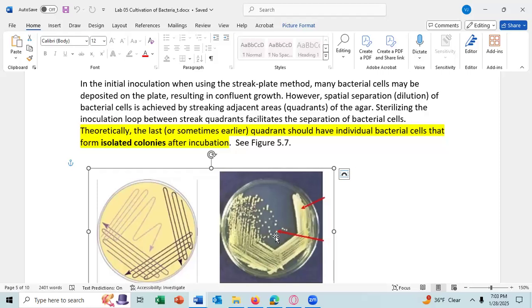And so he was streaking out these colonies, and he thought he had a pure culture, but it turned out it was actually formed by two different species. But that's very rare. For the first place, the media we normally use supplies nitrogen. We'll just word it that way.